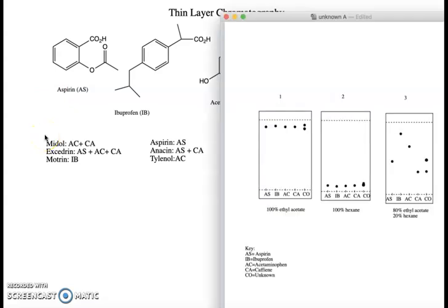So what we're going to do in analyzing our pain relievers is we're going to spot all four of them, one, two, three, four possible components across the bottom. And then this fifth lane is our unknown. And we're going to analyze them. And what we're going to do is we're going to analyze them in three different solvents. And we do this because choosing the correct solvent is a really tricky thing. And what I want to point out to you is that if my solvent is too polar, it's going to pull everything all the way up to the solvent front. And I won't see any difference between my spots. If my solvent's not polar enough, I will see it only moving a little bit and I still won't see any difference between my spots.